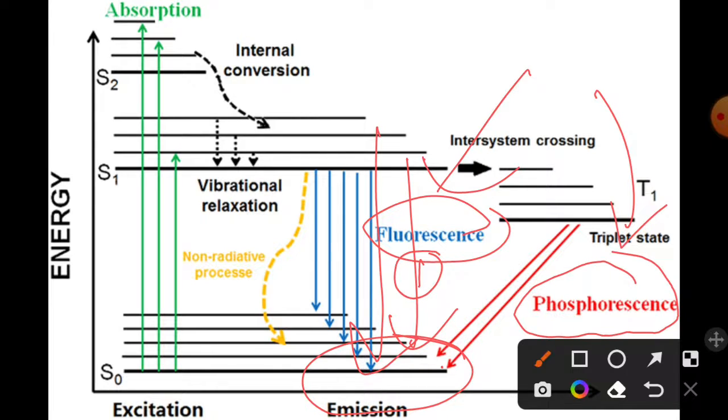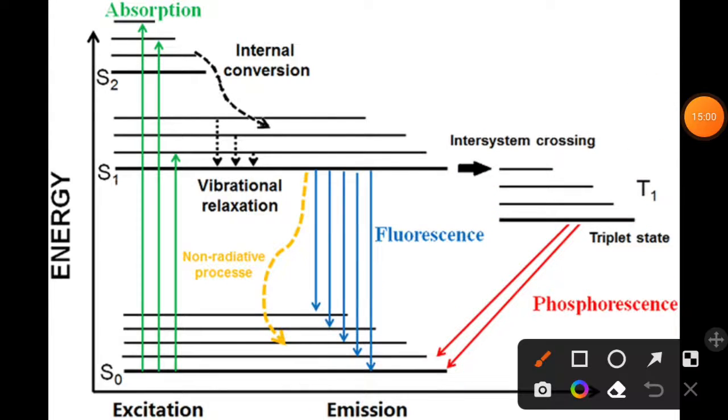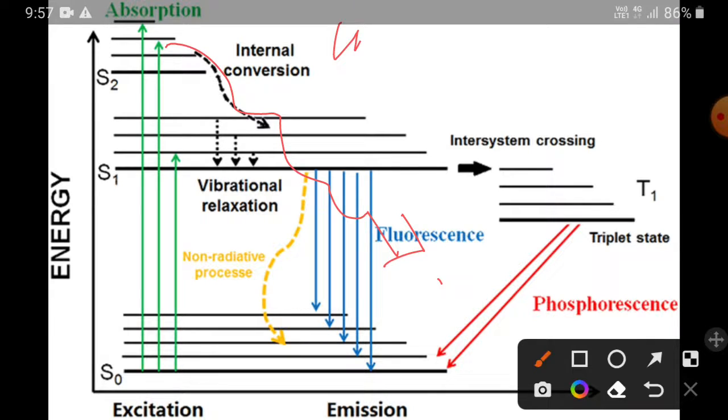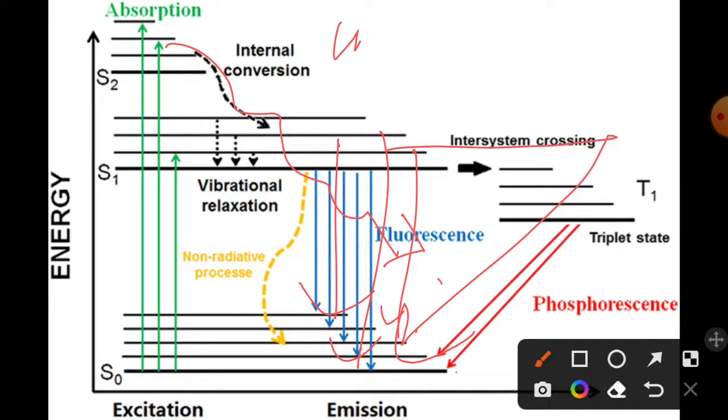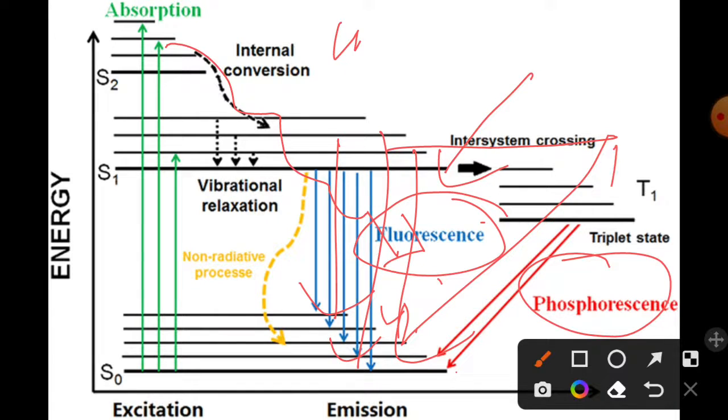So similar things can happen for a fluorochrome or fluorophore or fluorescent dye, because their travel from the unstable or excited state to the stable state can occur through various paths. The path can be easy, as in case of your friend, or in some cases the path can be time consuming. If the molecule comes back to its ground state very fast, then it will result in fluorescence. But if the molecule takes too much time to come back, then it will facilitate phosphorescence.